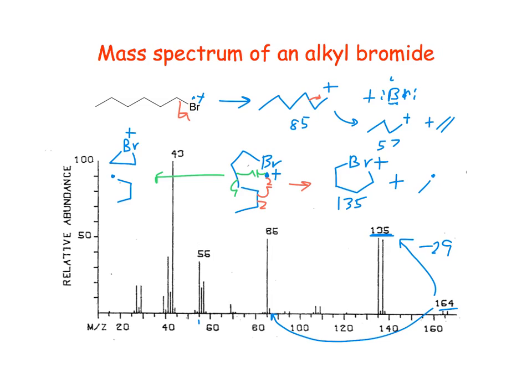And we lose the butyl radical, and this is at 107 and 109. Okay, so those are right here, 107, 109.